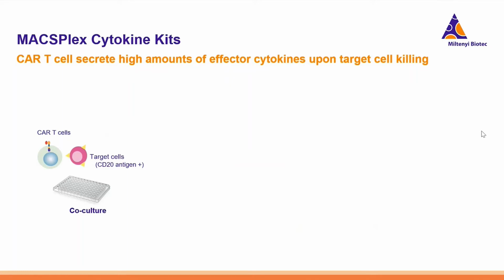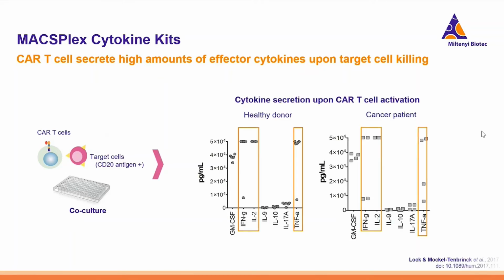Our next application examples involve the MACSPlex cytokine kits. So the second kit that I presented before. Also here, CAR T cells were co-cultured with target cells expressing the respective target antigen, in this case CD20. In this example, we evaluated the functionality and antigen-specific killing of manufactured CAR T cells using the MACSPlex assays.